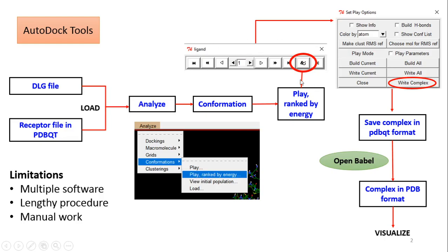This will open up another window, and in this window there is a button with which you can play or visualize the rank by energy.